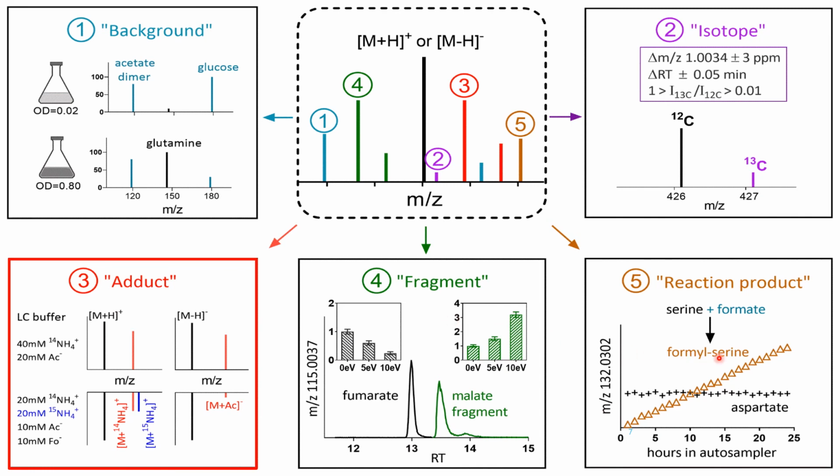The other issue is that there are additional compounds generated during sample storage. For example, serine can react with formate to generate a new compound called formyl serine, and this will complicate the data. So with all these complications, I think the actual number of metabolites is not a big number.